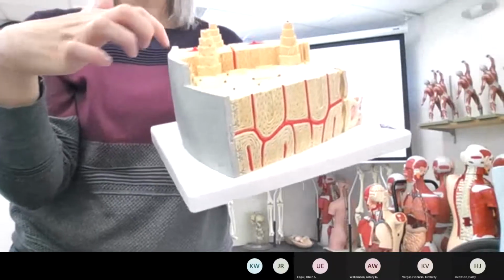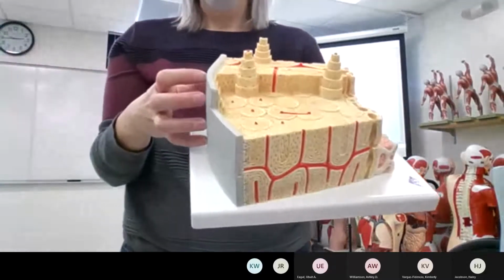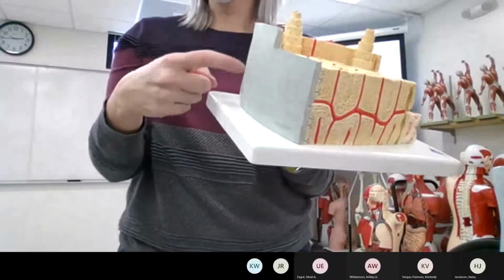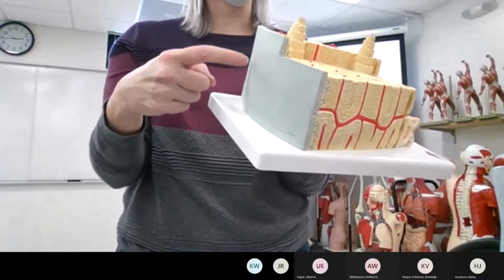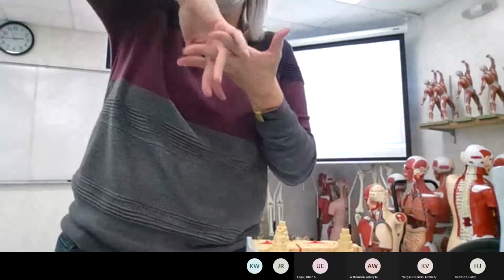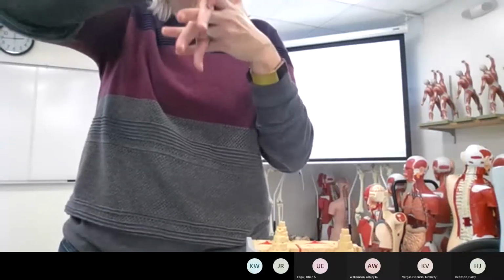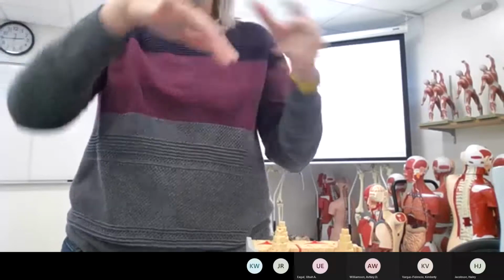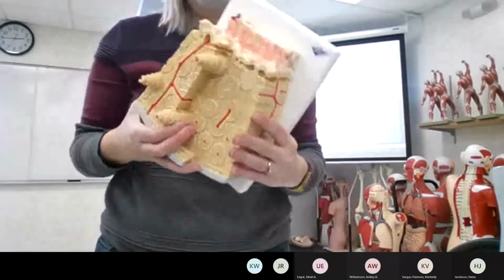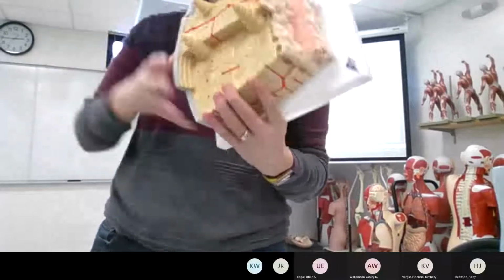And then there's fibroblasts, and there can be white blood cells and adipocytes and all that stuff in here. Remember this collagen in this dense irregular periosteum is what the ligaments and the tendons bind into, so that they can join to the bone. So there's the bone model, there's the bone picture.